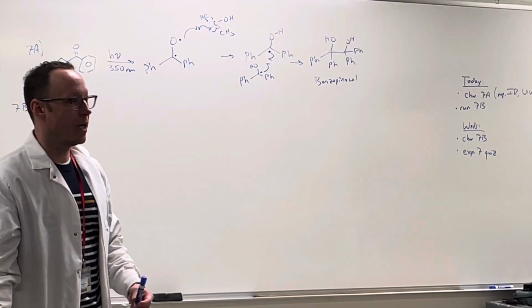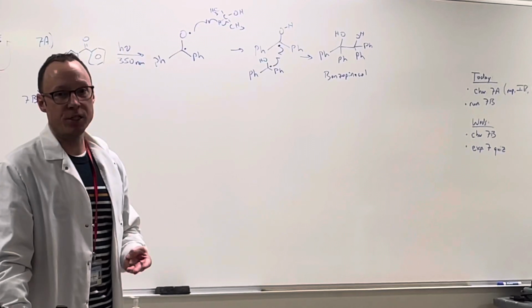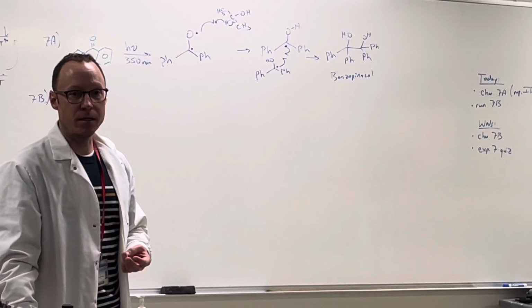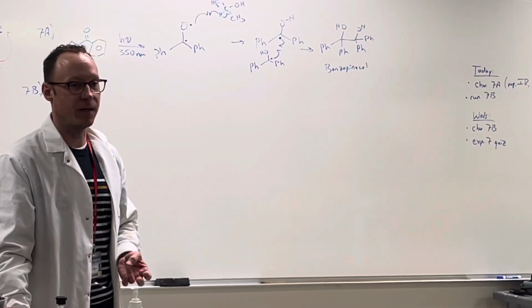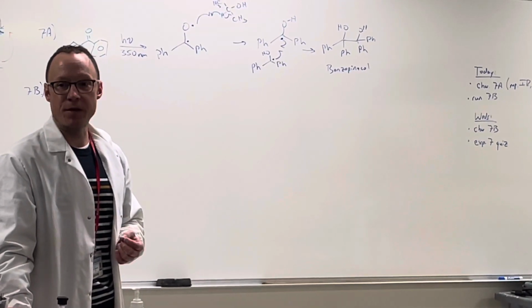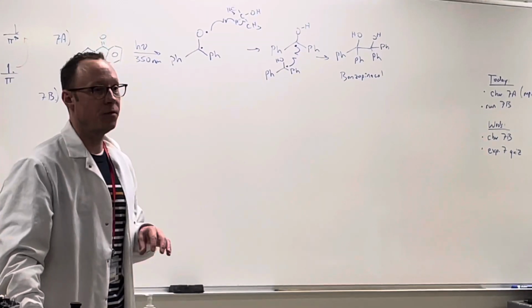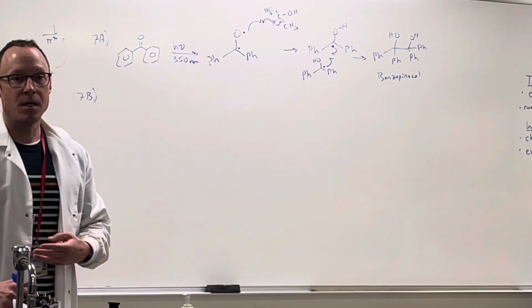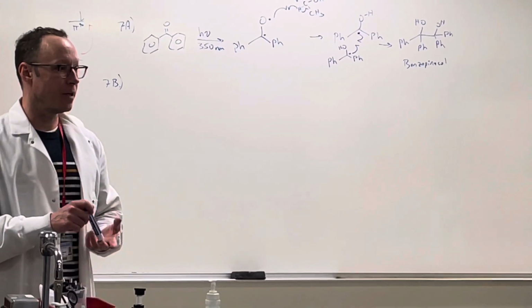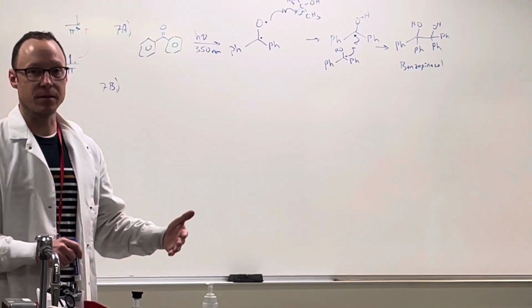In the same way with experiment 1 and 2, you ended up with 3 concentrations of UV sample: 10 to the negative third, 10 to the negative 4, 10 to the negative 5 molar. You want to do the same thing here. Right? So ultimately, you should be going into the UV room with your 3 centrifuge tubes. Again, negative third, negative 4, negative 5 molar solutions. And you'll run them in series.